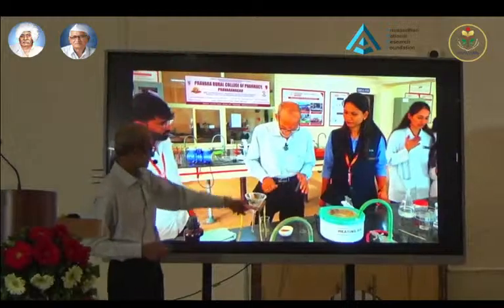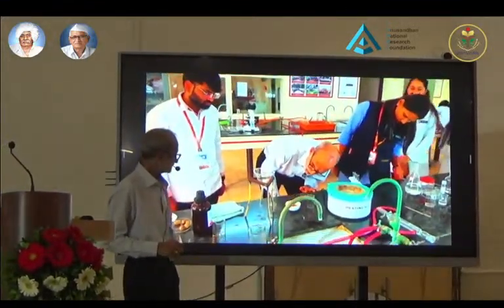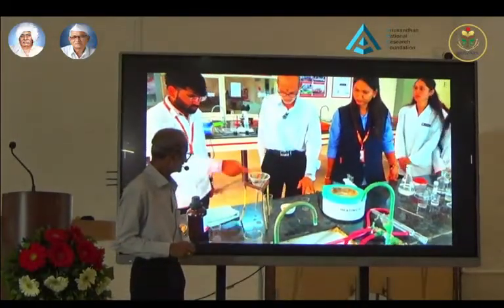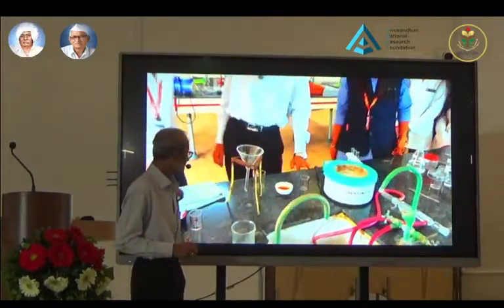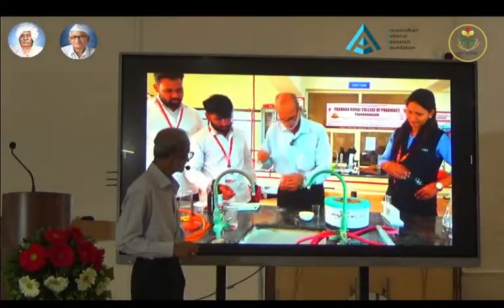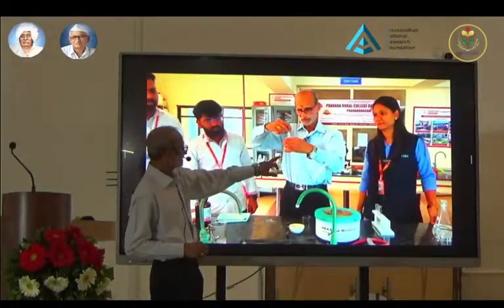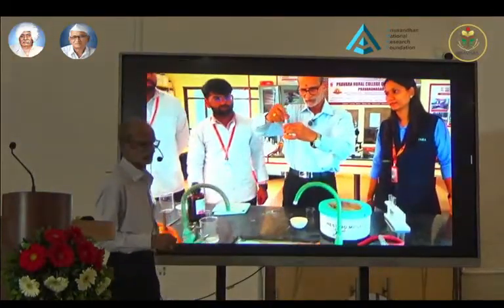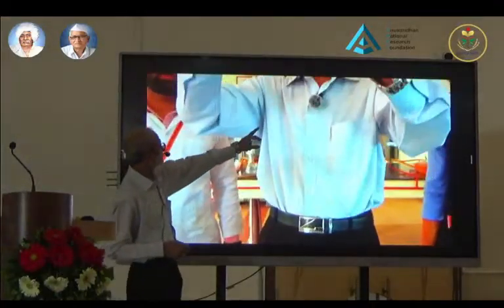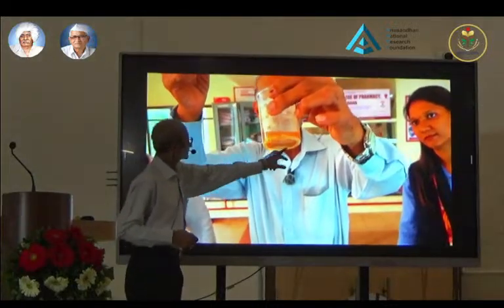Then I have put a small quantity in a test tube, and after cooling it, now you can see the separation of the product. The product got separated in the form of a precipitate.